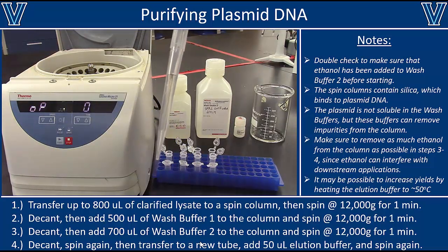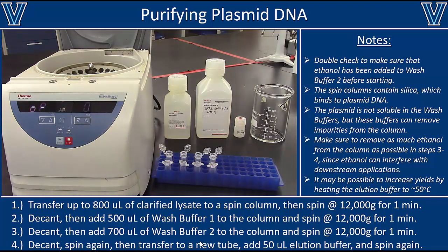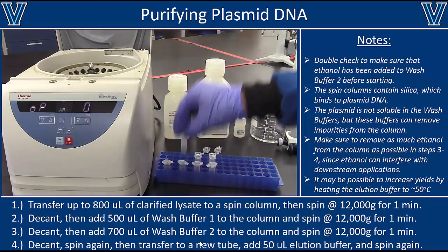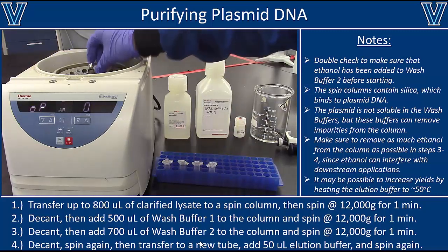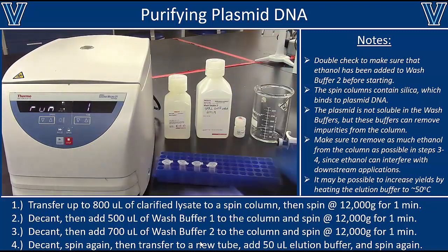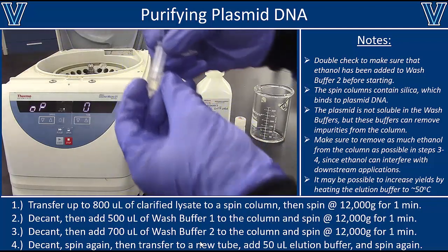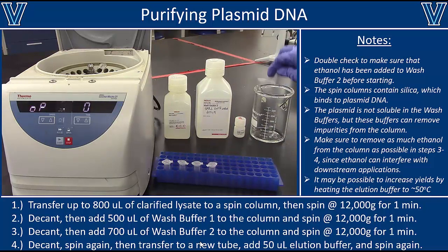But I do want to point out here, be very careful that you don't get any of that white pellet material onto the spin column, because that represents impurities. You could contaminate your final sample if any of that white material gets onto the spin column. So definitely err on the side of caution here. If you're trying to get the last few microliters of your supernatant, but there are little pieces of white chunks floating around, just leave them behind. Err on the side of caution and leave any white chunks at the cost of sacrificing some plasmid DNA in that lysate tube.